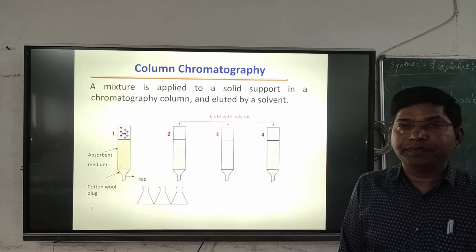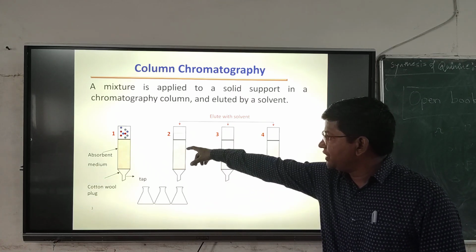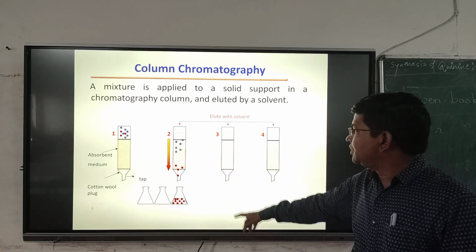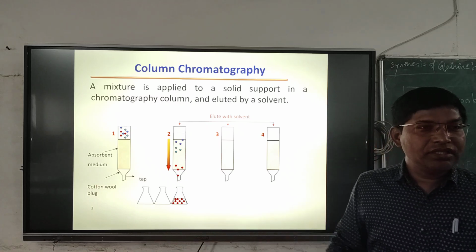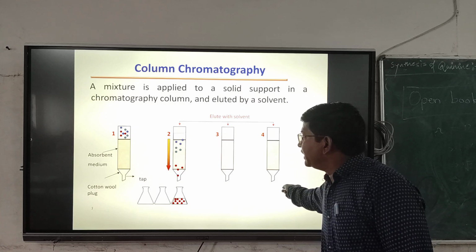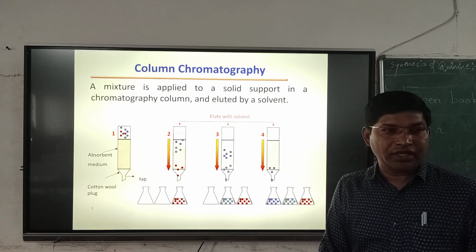Suppose you don't have an HPLC in your lab, then we can purify our compound mixture in the lab. First we will put our compound mixture on the adsorbent, and we will take different flasks for taking different fractions of the eluent coming from the column. Maybe first we will take 1 minute, then 2 minutes, then 3 minutes. In this way we can take the fractions. This is the first fraction. Maybe this fraction has your pure synthesized compound, followed by the raw material that you took during the synthesis. This is the second material, and finally we may have a third material, which may be the impurities.